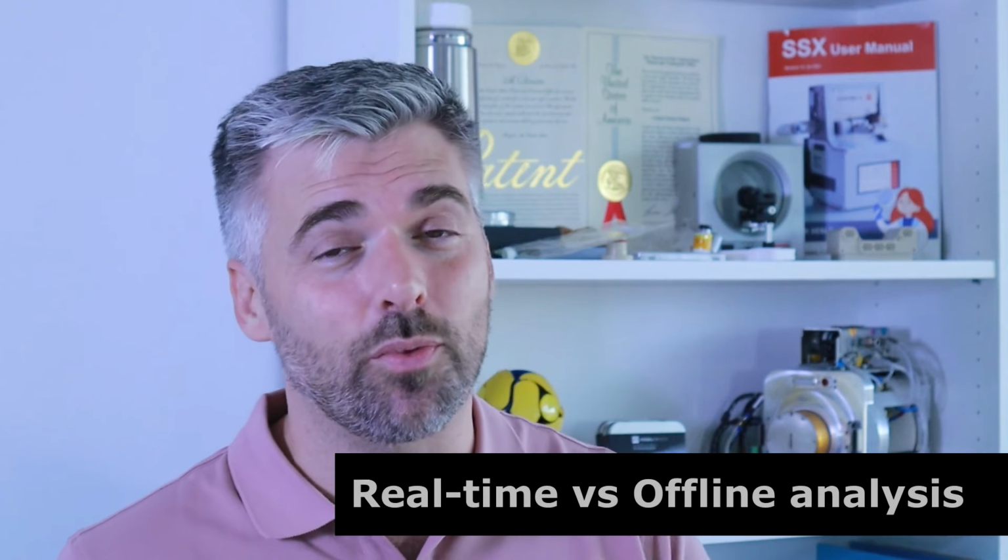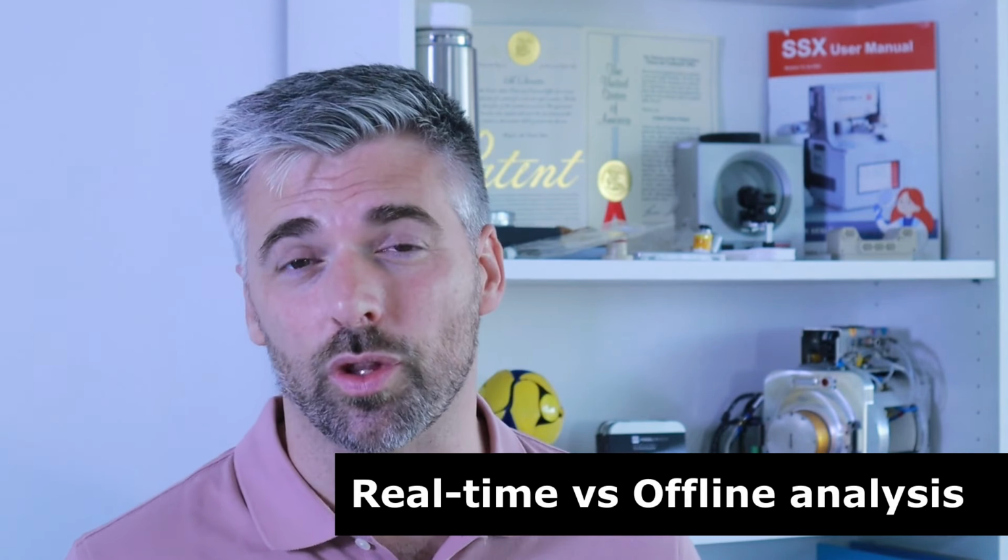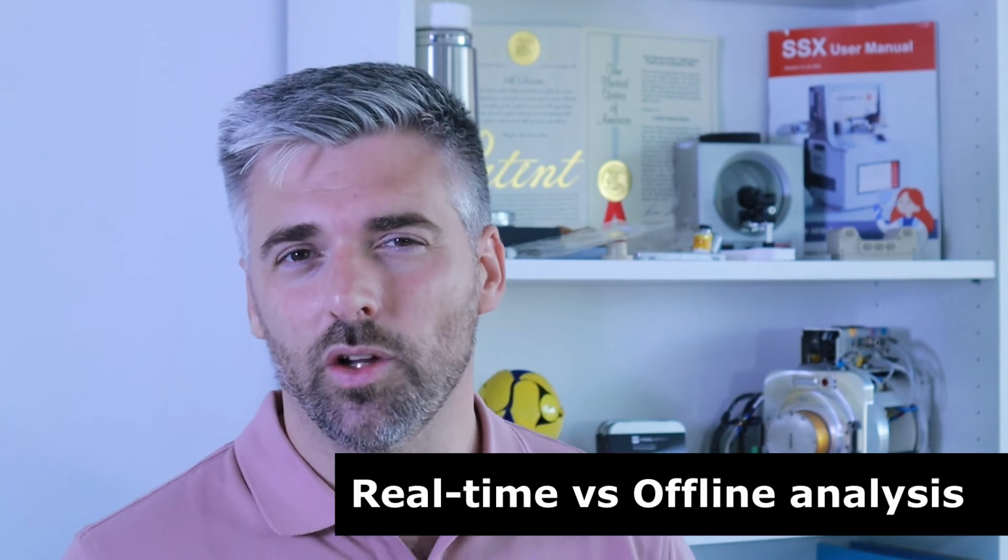That's it. Hold on. I've been talking about analyzing breath in real time, but there are groups doing some serious research with offline analysis. In offline breath analysis, you first collect the breath sample and then take it to the lab for analysis. Some researchers use bags to capture the breath, but the most common method is thermal desorption coupled with gas chromatography and mass spectrometry.